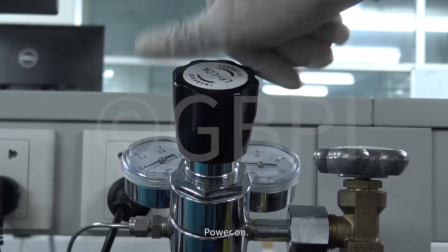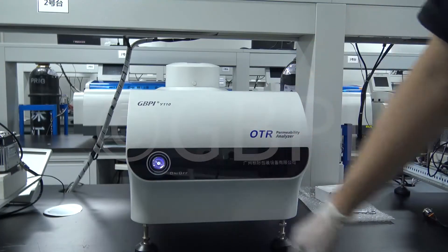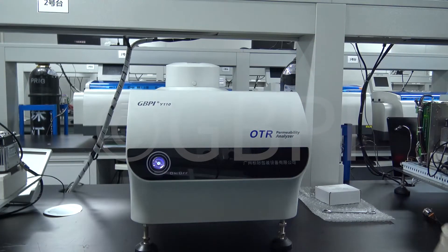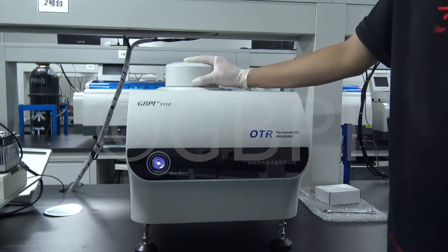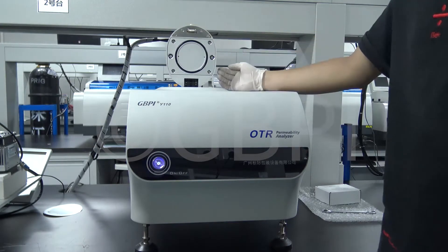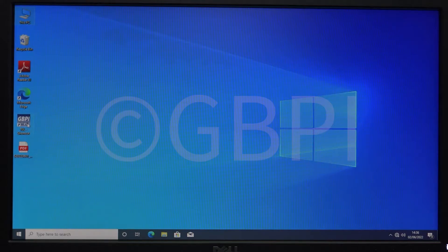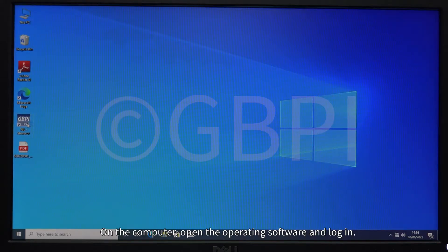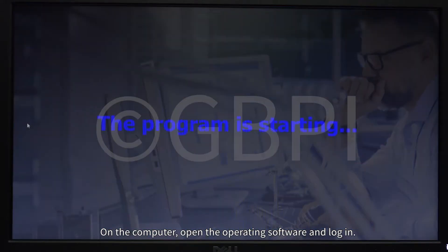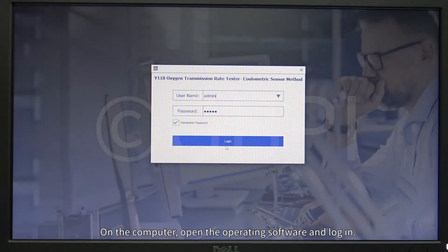Power on. On the computer, open the operating software and login.